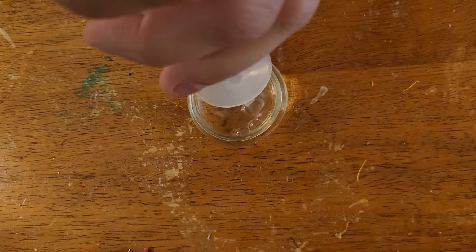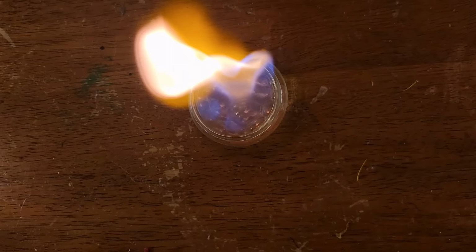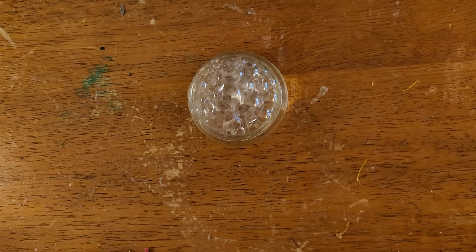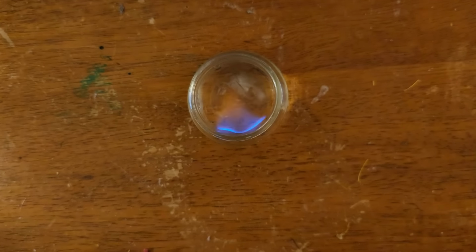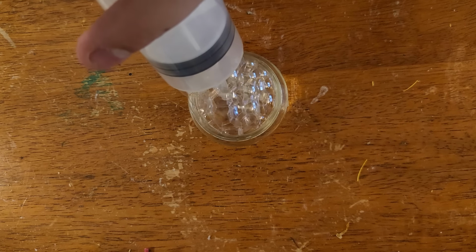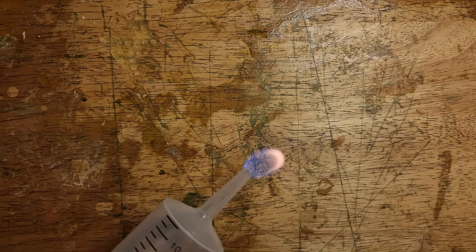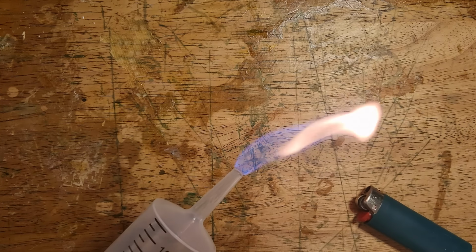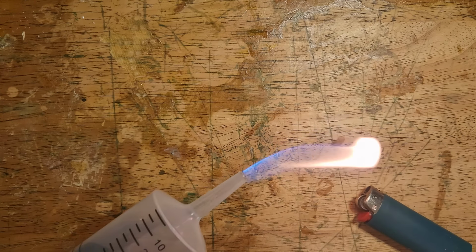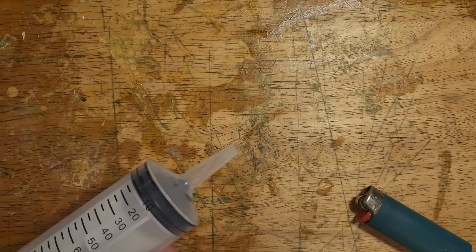Let's test a sample of it to see if it burns. Yep, that's gotta be ethane, because if it was oxygen, the bubbles wouldn't burn. It's also definitely not hydrogen, because it has such a slow, lazy burn, whereas hydrogen goes off really quickly even if it's not mixed with oxygen. It also burns straight from a syringe. Okay, let's get back to making more gas.